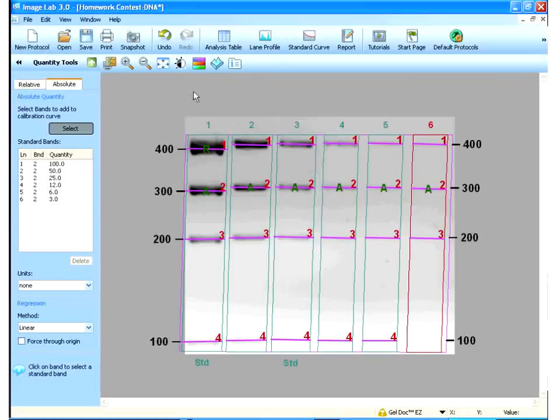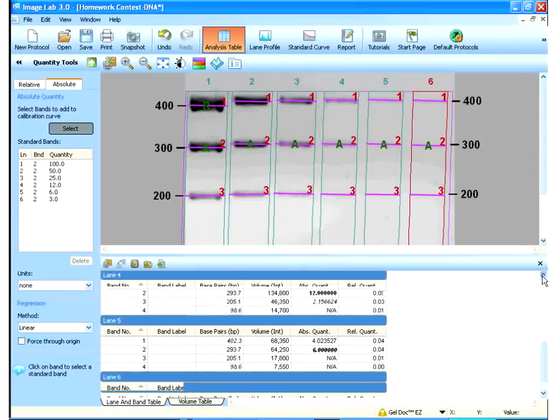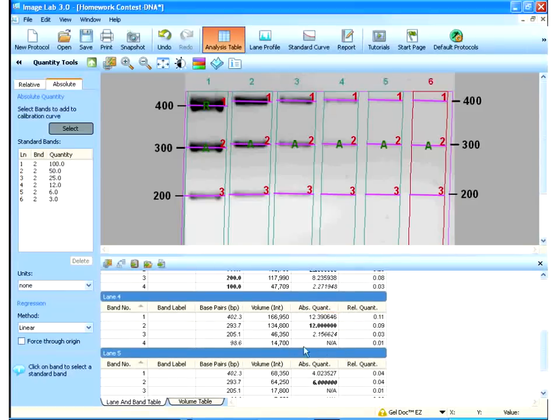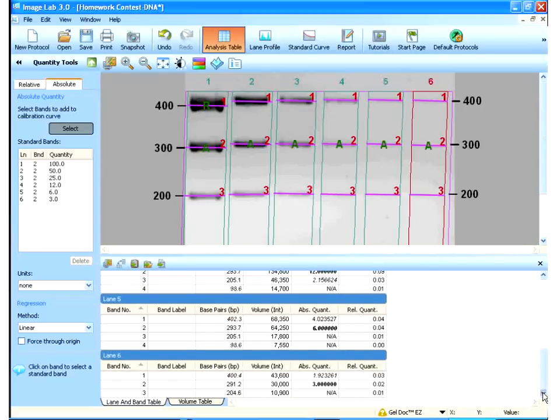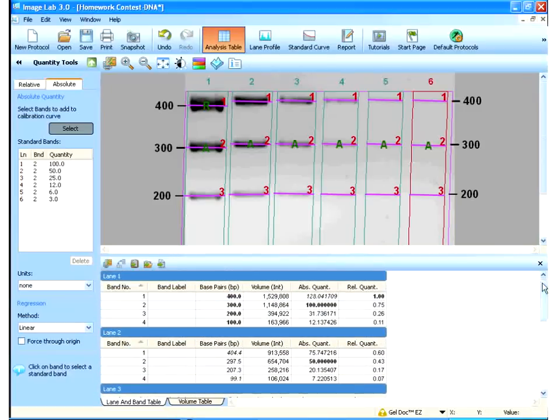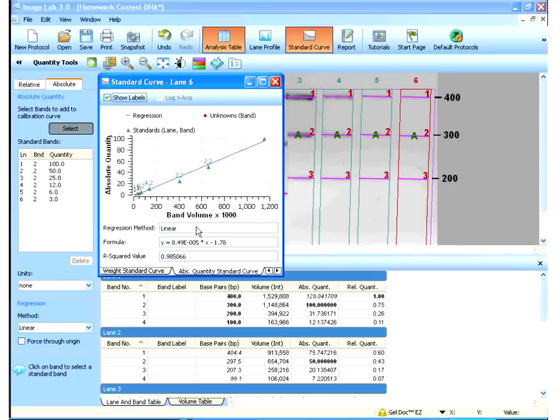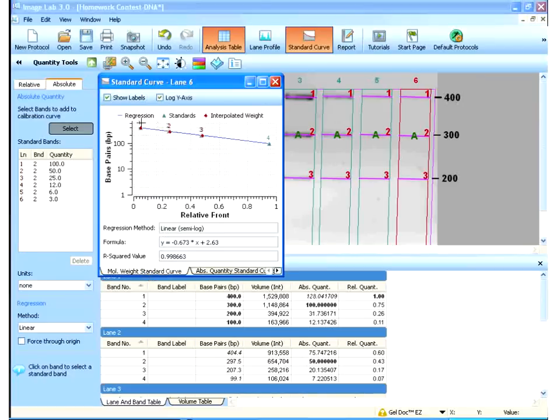Now, if I go to analysis table, I have the absolute quantity of all the different bands. The ones that are in A are ones that fell outside of the range of densities of my standard curve. So, in lane 4, it wouldn't record it. And, in lane 6, band 3 was not recorded because the intensity of this band is lower than this one here. So, it's in A. But, all the other ones are available based on my standard curve. And, I can actually even look at the standard curve up here under standard curve. And, I can see the fit of the standard curve that I did. So, this standard curve is an R squared of 0.98, which is not bad. 0.98 for that standard curve. But, I just prepared because I knew it was a two-fold dilution series. I can also look at the molecular weight standard curve as well for all my molecular weights. To look at the data there as well. And, this is all printable, exportable data.